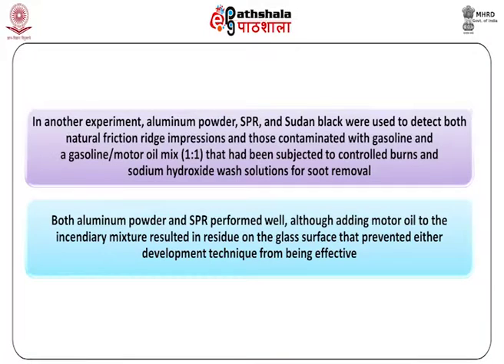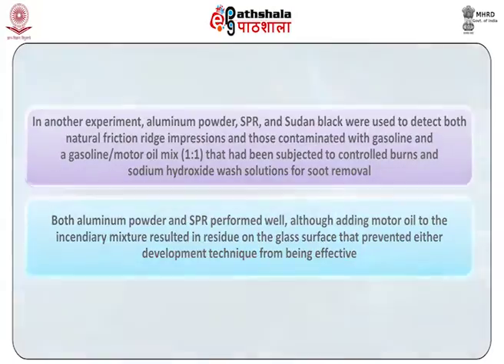In another experiment, aluminium powder, the small particle reagent and Sudan black were used to detect both natural friction ridge impressions and those contaminated with gasoline and a gasoline and motor oil mix in a ratio of 1:1, and that had been subjected to controlled burns and sodium hydroxide wash solutions for soot removal. Both aluminium powder and SPR performed well, although adding motor oil to the incendiary mixture resulted in residue on the glass surface that prevented either development technique from being effective.